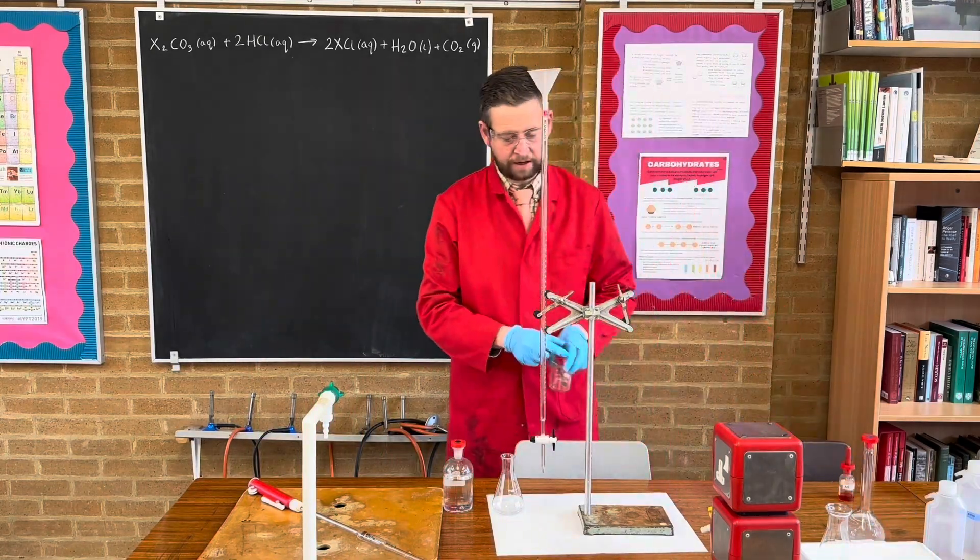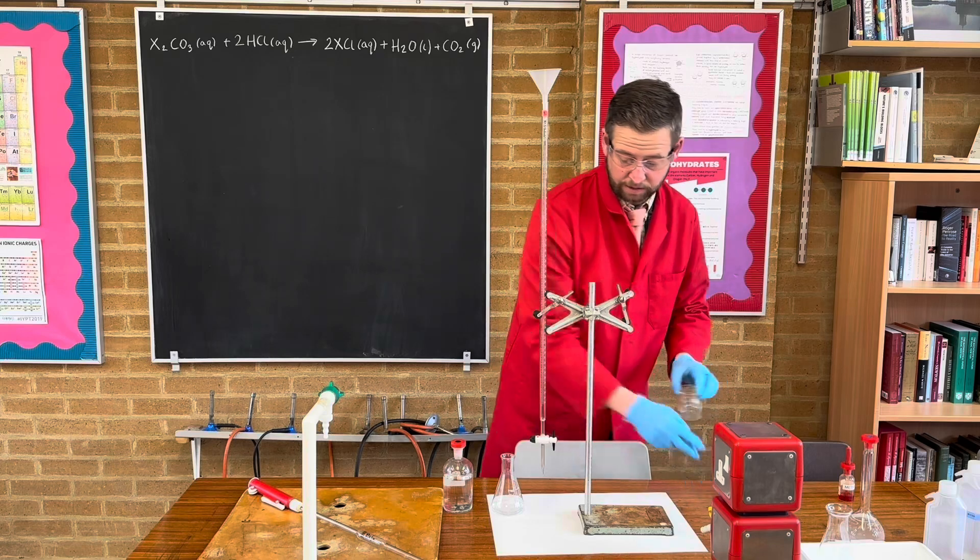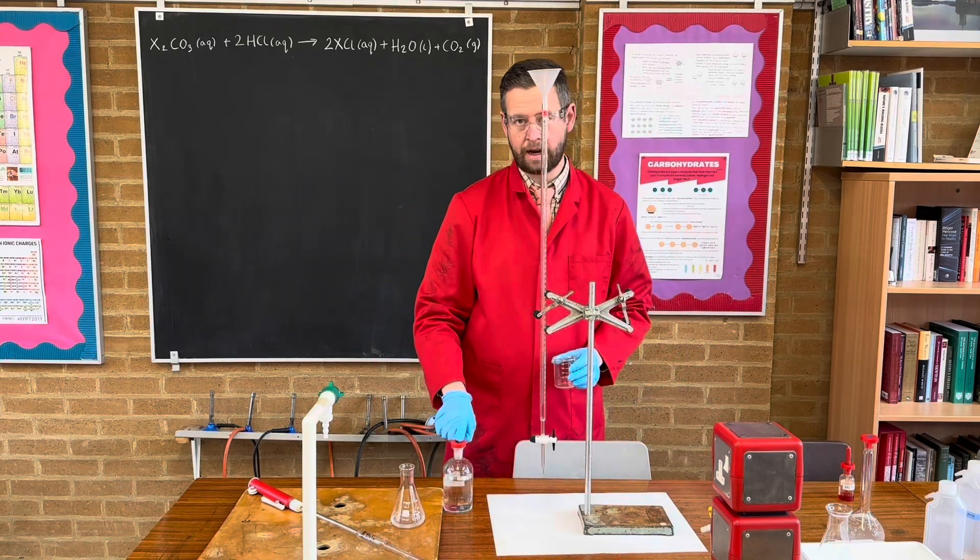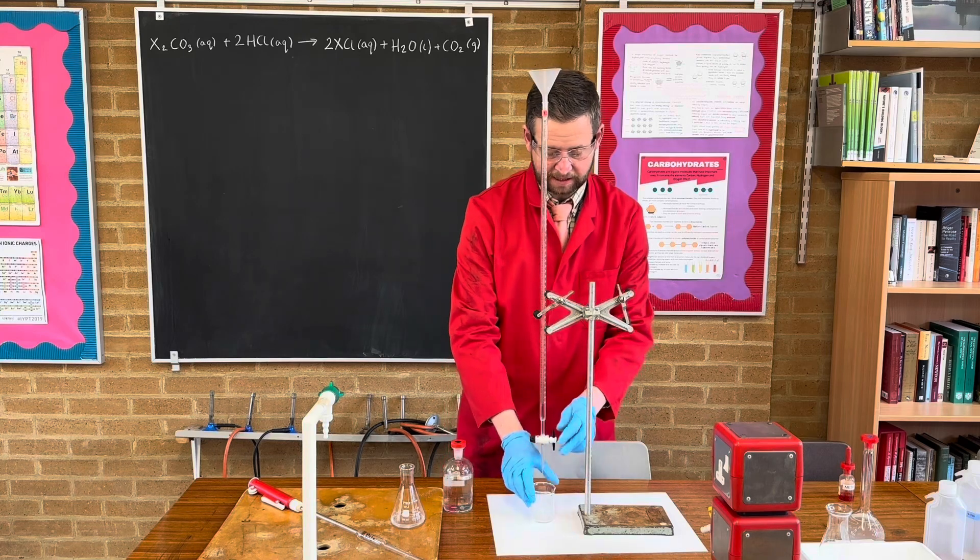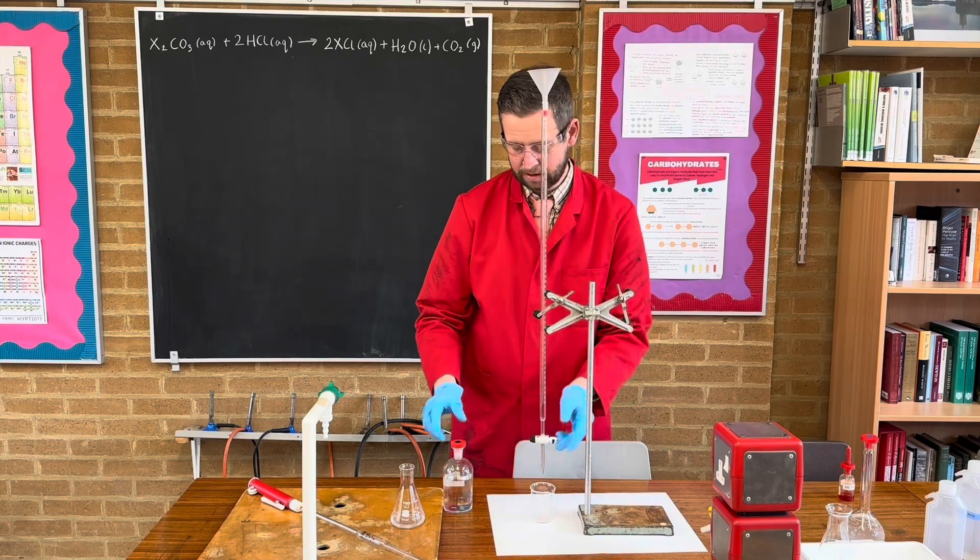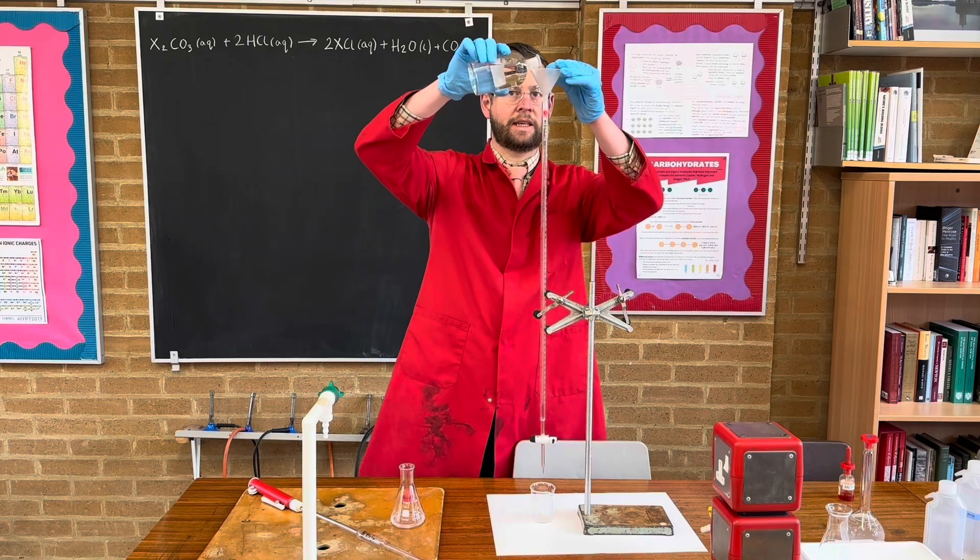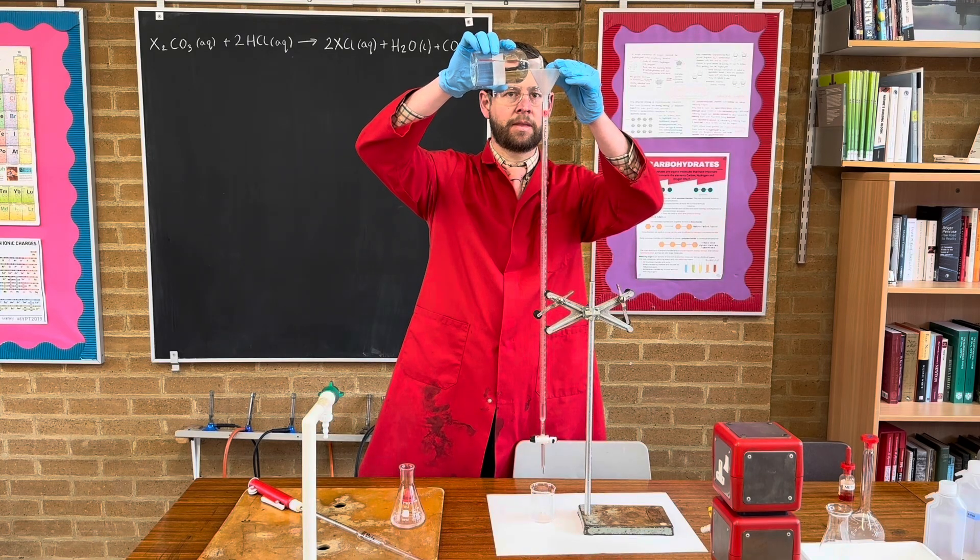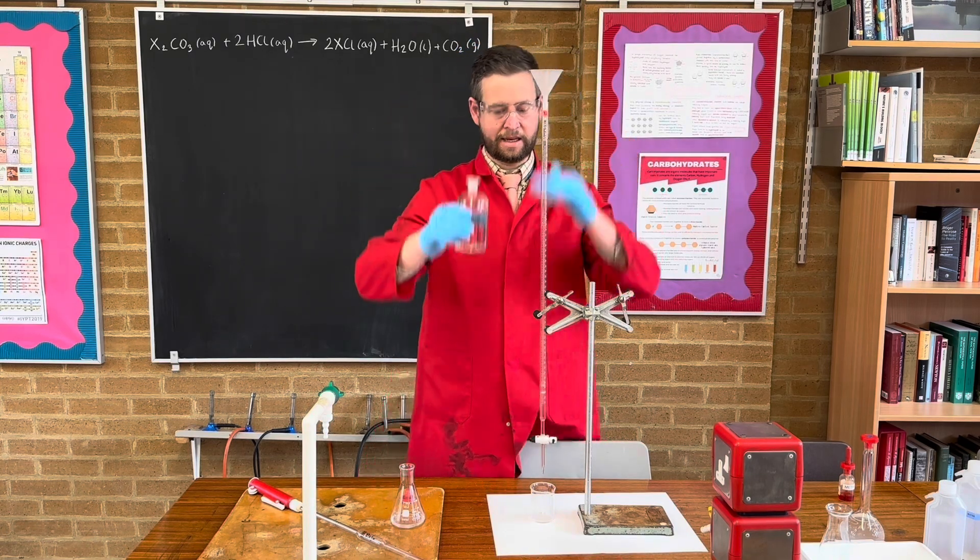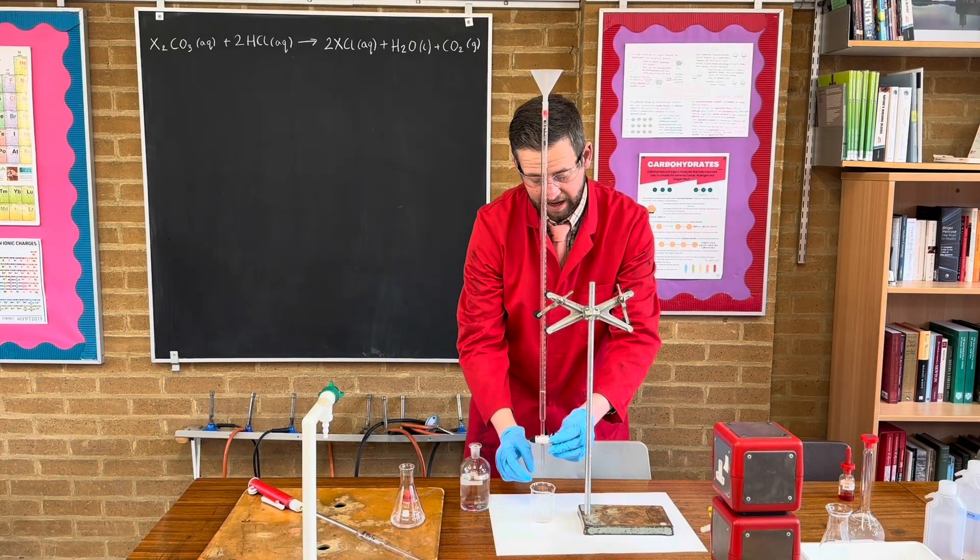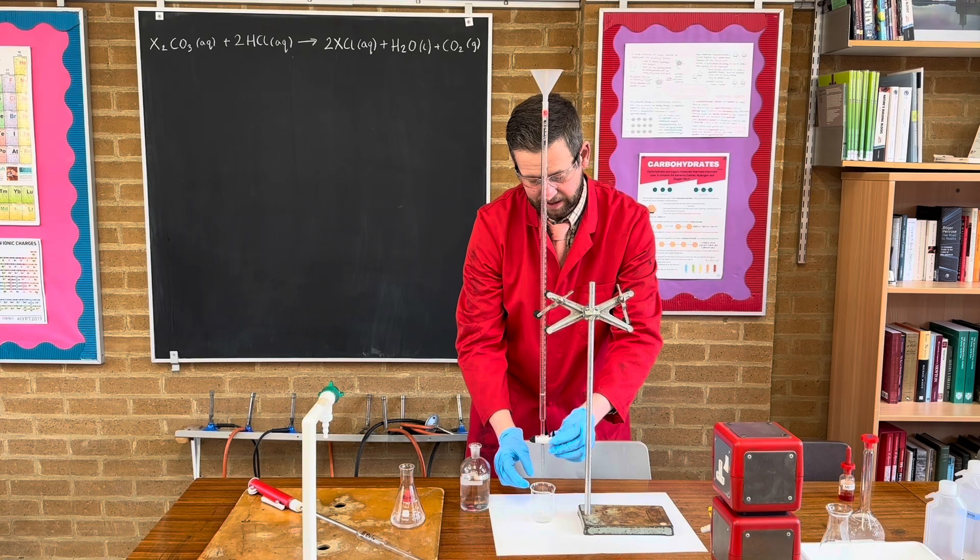When it comes to filling up the burette, the very first thing I'm going to do is just rinse it through with the chemical hydrochloric acid. So I'm going to place a beaker just here, stop the stock up. I'm just going to add a little bit of hydrochloric acid in here, just in case there has been anything else in here. And then we're going to flush it through like this. This will also get rid of the air bubble.